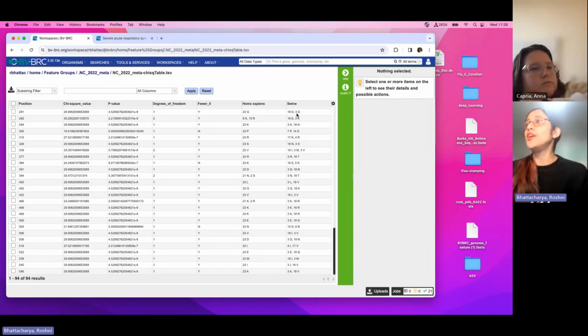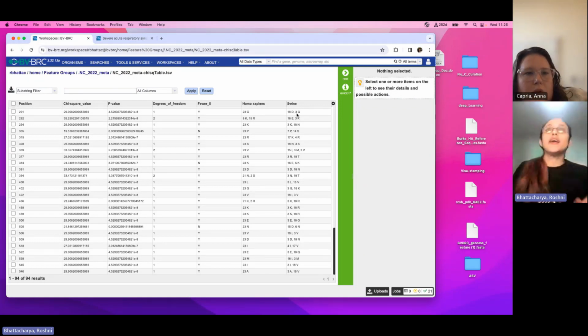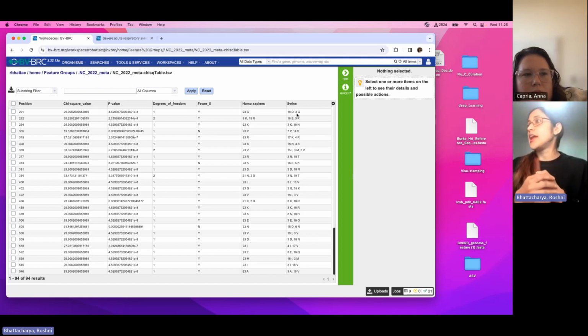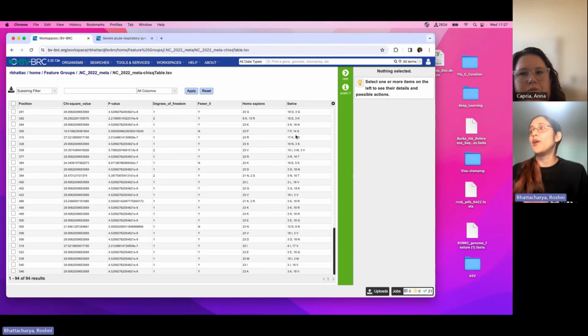But how do we know it's those strains which are similar to the human? So to make it more informational or to get a clearer picture, the next step would be to do a multiple sequence alignment and just verify that these 3, which have a G, are actually those swine isolates or swine strains which are similar to the humans or something like that. Then pick out those which actually differ. Maybe these 3 are a separate 3, something else.